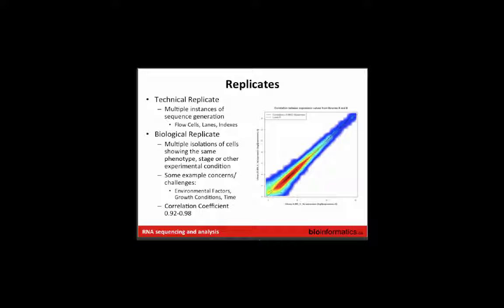There was a question at the back too. Yeah, so the question is, if you have bad samples, how do you decide to throw them out? That is a really hard question. There seems to be a very strong tendency to not want to throw out data, no matter what. And this happens at every step. So we looked at the RNA integrity numbers and things like this, and people try to say, oh, if it's RIN less than 6 or less than 8, then we shouldn't do it. And everyone agrees, yeah, that seems reasonable.